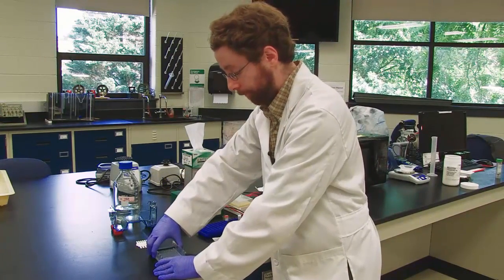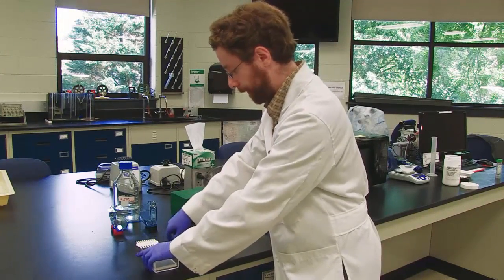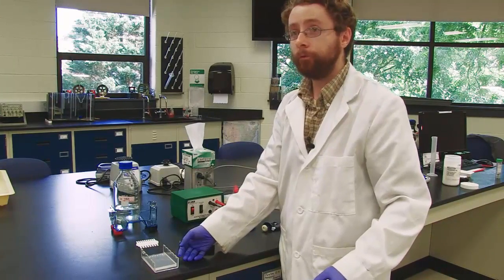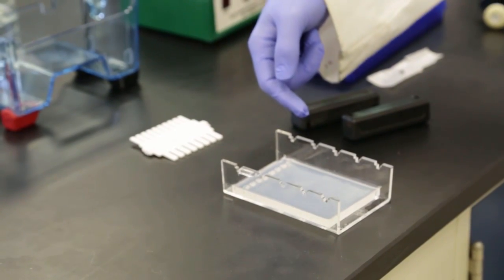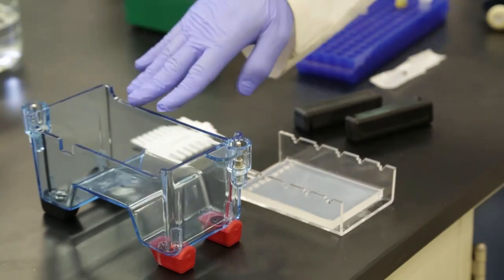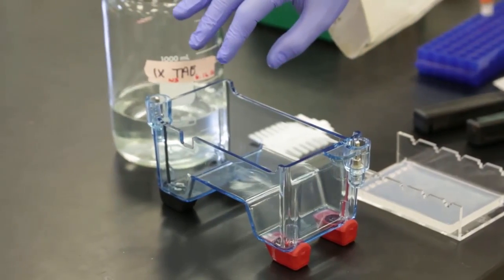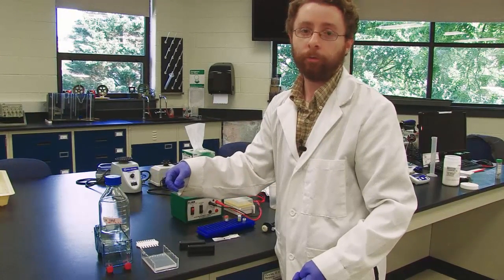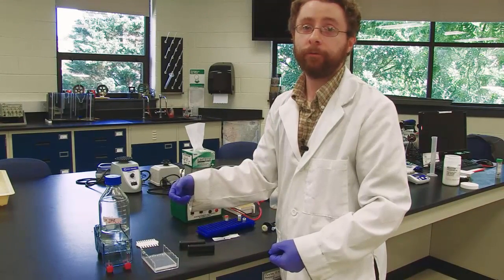So I will remove my two ends. And now there's two ways we can load this. We can either load it dry, where I take my DNA and add it directly into the well, or I can take my gel, put it into the gel box, add running buffer, and then load the gel that way. Your professor or lab instructor will let you know which method they prefer. In this video, I'm going to demonstrate the dry method.